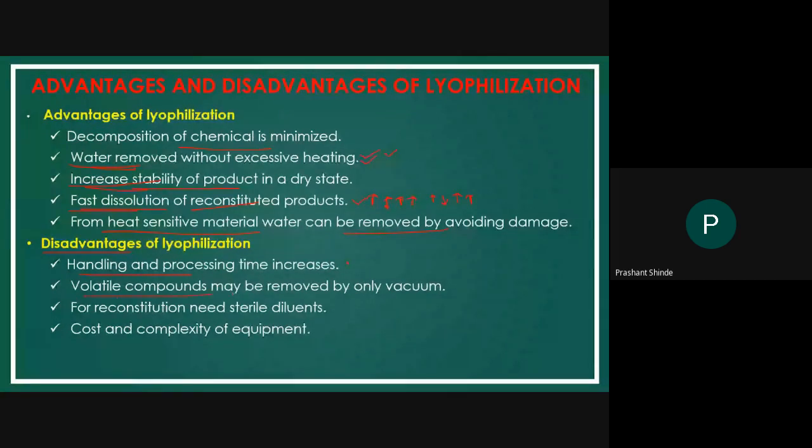Next, volatile compounds may be removed by the vacuum. Next, reconstitution needs sterilized diluent. That means whatever material we are using for lyophilization should be sterilized. And next, the cost and complexity of equipment is somewhat high, so ultimately it will increase the end price of the product. So these are the disadvantages of lyophilization.